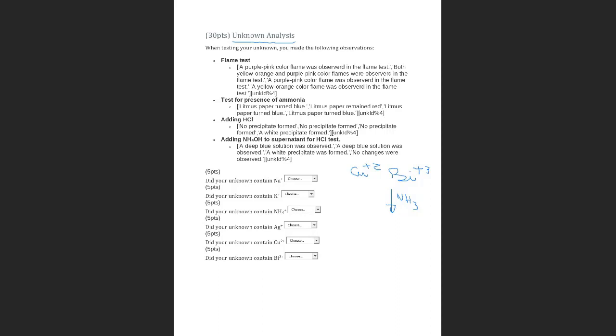Question. Yes. That last bullet point, what does that mean? That you added HCl and then that other substance and then HCl again? Is that what it's asking, or is that what it's saying? No, no, no. The procedure will be, let me show you here. Okay, experiment, share.